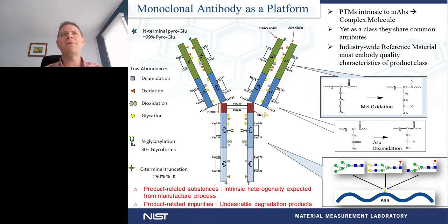So these are meant to represent various low abundance post-translational modifications. On the right-hand side, I have a couple of different post-translational modifications. For example, methionine oxidation, where the sulfur of this individual amino acid can get oxidized. We have asparagine deamidation, where the NH2 group can actually be changed to an OH group. So we're going from an asparagine to an aspartic acid. And then very importantly, we have glycosylation. In the bottom right-hand corner, you can see this polypeptide chain with the asparagine highlighted. And I have 3 different glycans highlighted here.